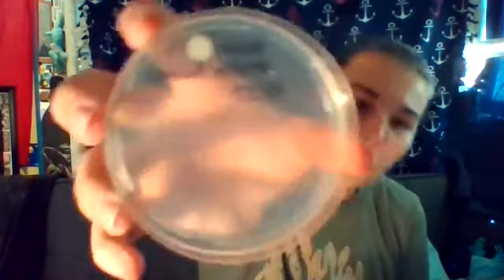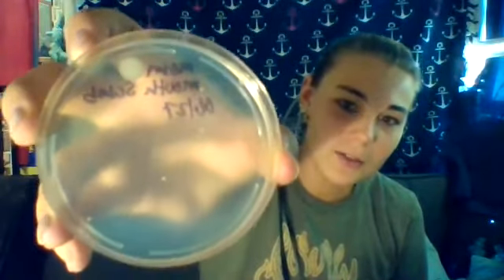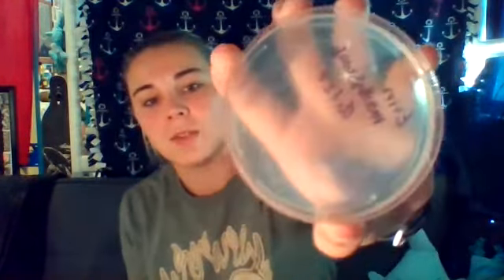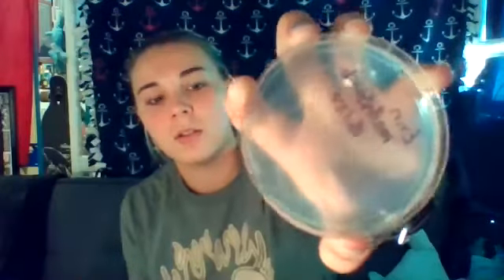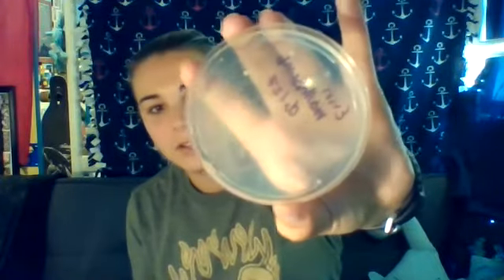It's really gross — I have some over here that have been sitting for a bit. This one I actually swabbed from the inside of my mom's mouth, so you can see something growing at the top and a few little speckles growing through the agar. It's dated so I know when I swabbed it. This one I swabbed from my friend's mom's mouth — she's got a lot more speckles. She has two younger kids, so I'm assuming she has a little bit more bacteria on her.